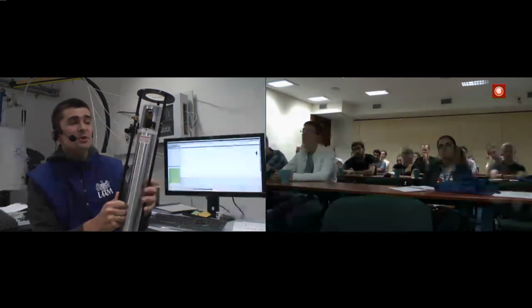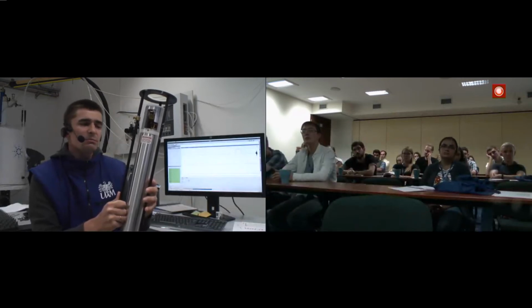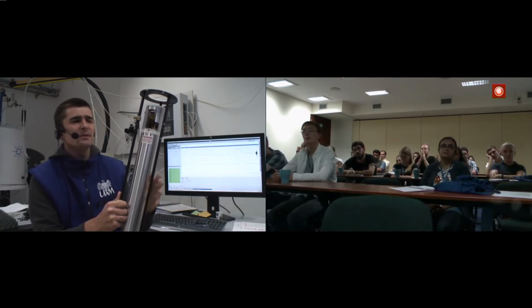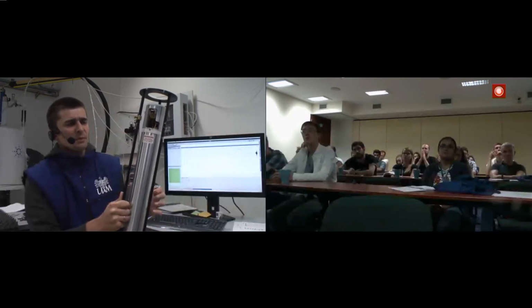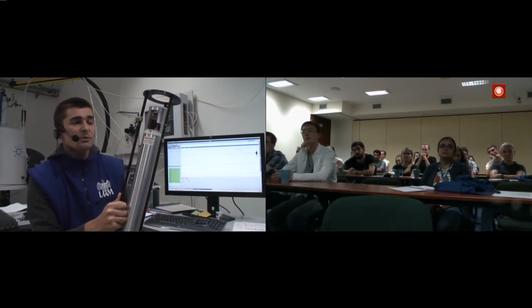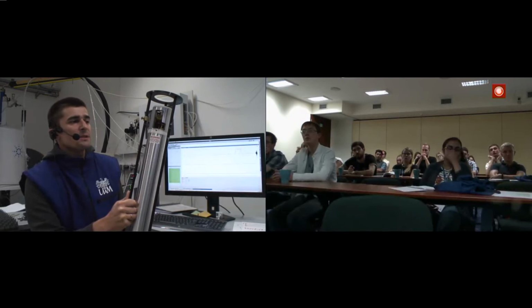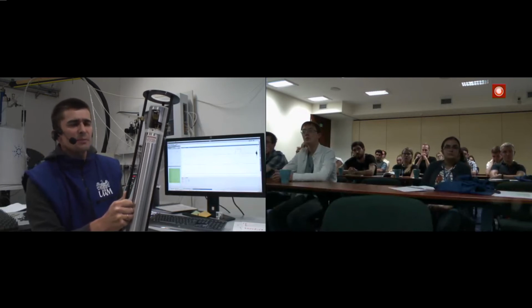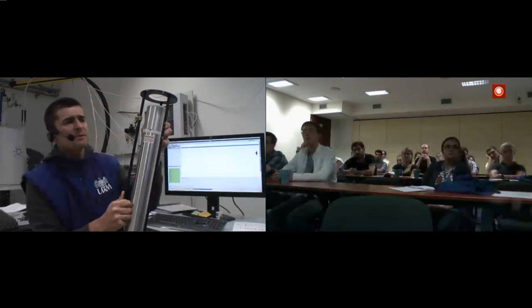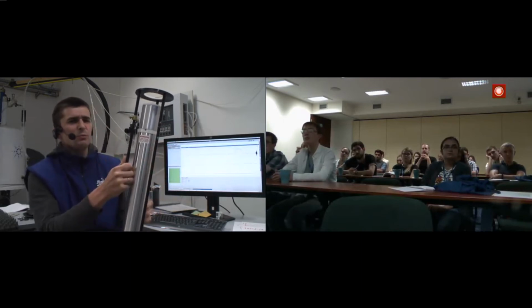For certain probe heads, we can reach dozens of kilohertz frequencies. For this particular probe head, we can reach only about 10 kilohertz, because our rotors are relatively large. For the one which I'm going to use today, which is installed just underneath my magnet now, we can reach 18 kilohertz, which is relatively fast. However, for biological samples, we would like to have much faster rotation. And why is it necessary?